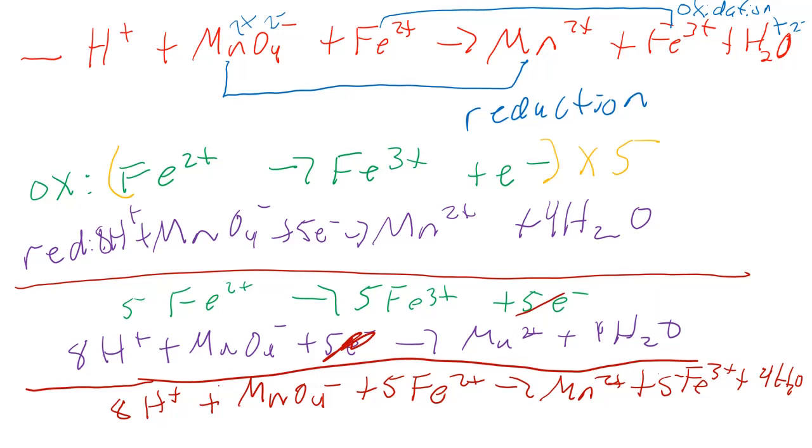So if you get any of the permanganate solution on your skin, you want to wash it off. If you get it on your clothes, it's probably going to leave a stain because it's a pretty dark color. So you want to be careful with that.